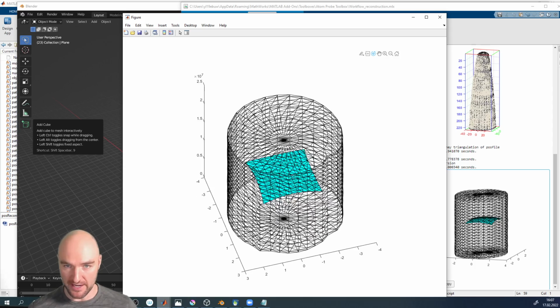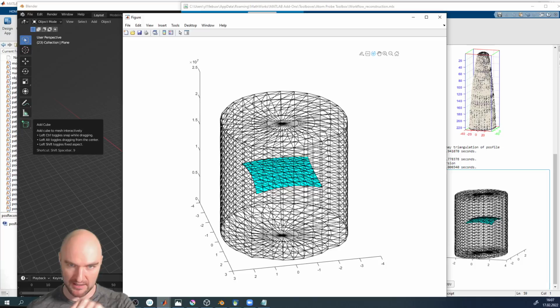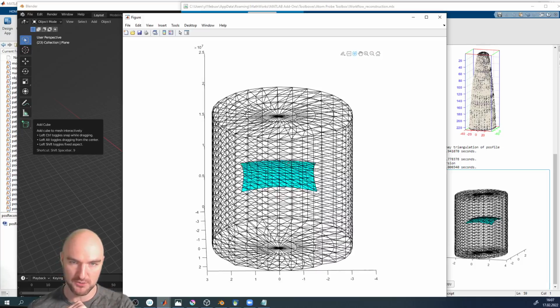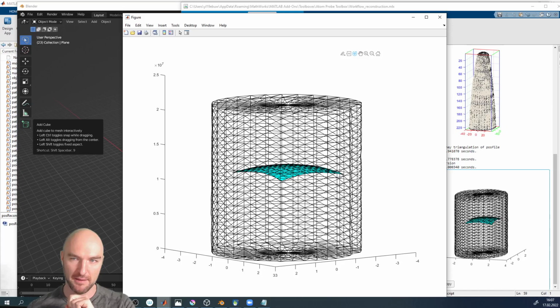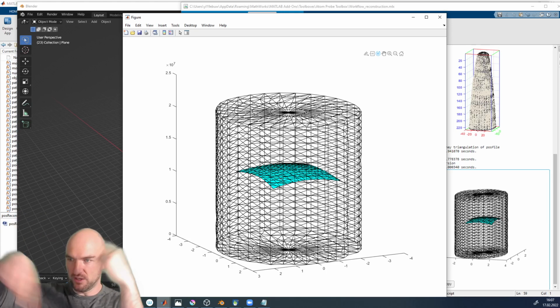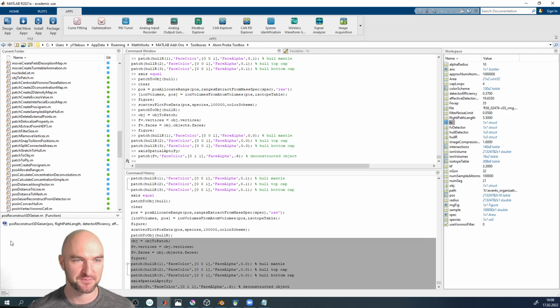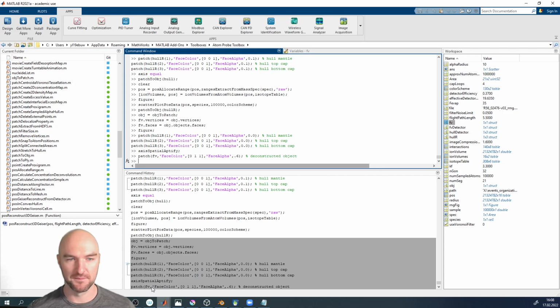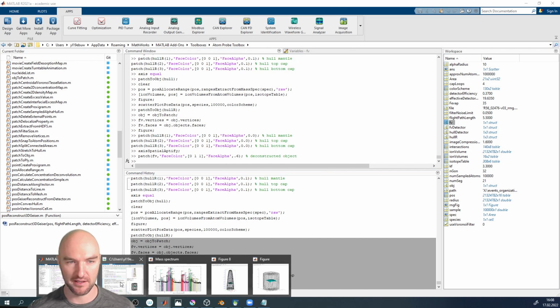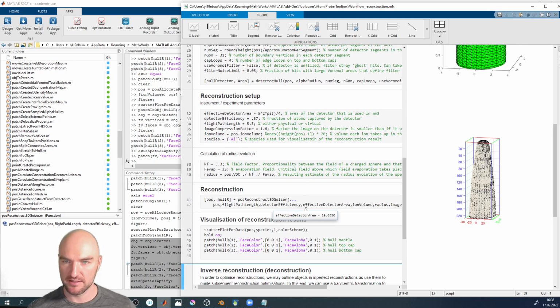But essentially, if I now go and throw that plane into the reconstruction again as a co-reconstructed object, what's going to happen? Obviously, it's supposed to come out exactly the same way as it looked before, which means we have completed the cycle. So let's go and do that. I think we're gonna do that here in the reconstruction.